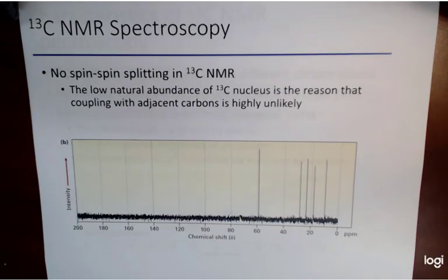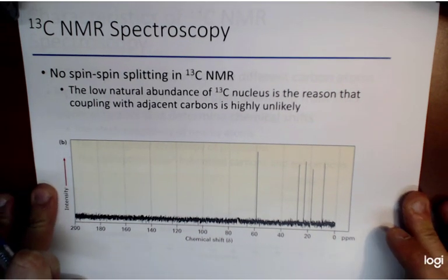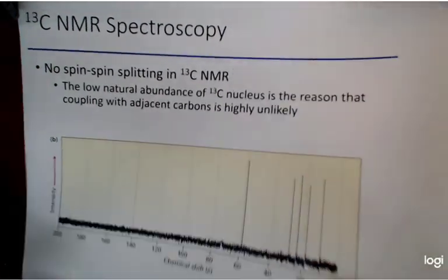Okay, in particular, really we're just going to see a certain number of peaks based off the structure. So you're going to be looking at symmetry to tell you pretty much how many different carbon signals you should see, but also there's going to be trends based off of structure, just like we saw with proton NMR as well. All right, so just looking at the number.